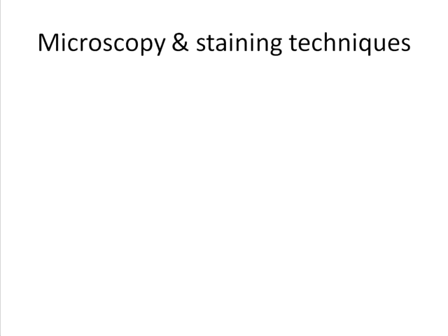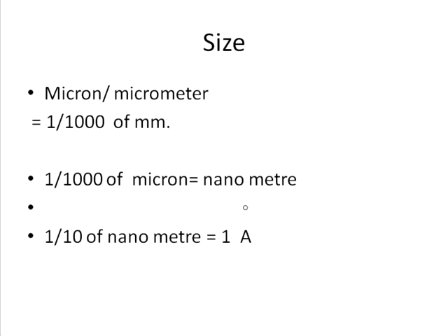In this video module, you will learn about microscopy and the various staining techniques that we use for seeing bacteria. The size of bacteria is measured in microns or micrometers. It is denoted by the mu symbol.